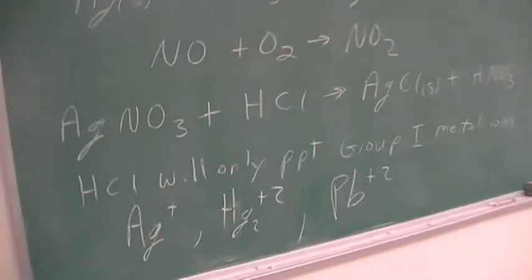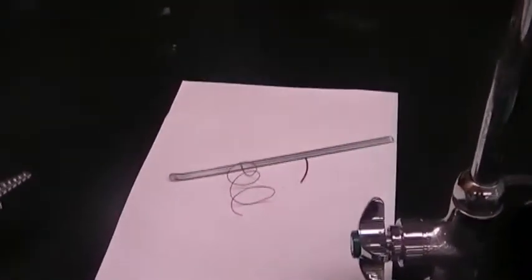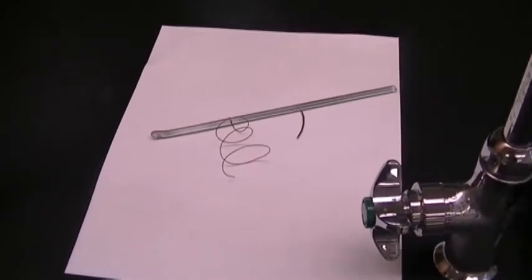Alright, so I said that I had started this already, and I will show you where we're at. So I made another coil. The first thing I did was take our unknown. An unknown alloy is just an alloy that you would use for some sort of welding. It's going to be some silver alloy.